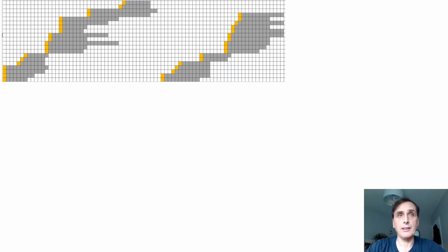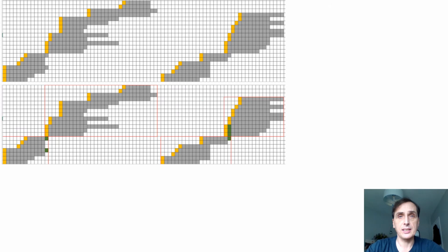And if I look more closely at the data, I can also see that this first subsection of data here actually contains a natural break in the data and can be split into two different subsections as shown, 1 and 2.